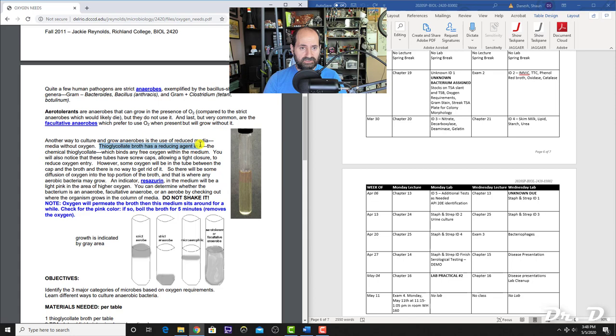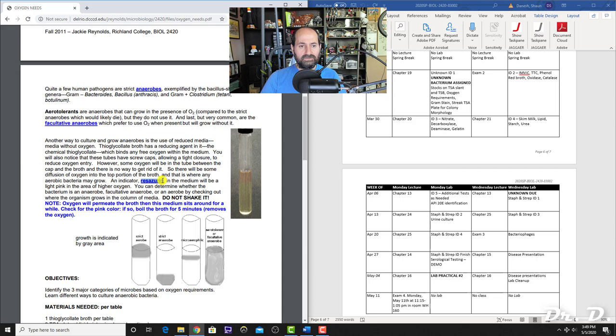Thioglycolate broth has a reducing agent—the thioglycolate—which binds to free oxygen in the medium. The indicator resazurin turns pink if there are high levels of oxygen in the medium. The thioglycolate removes oxygen, binding it and making it unavailable to organisms inside. Depending on where the bacteria grow in the tube, you can determine their oxygen requirements.